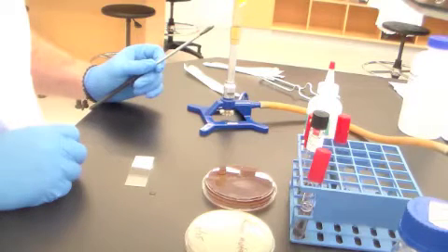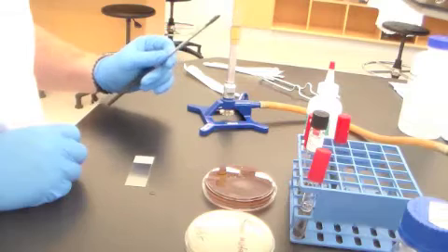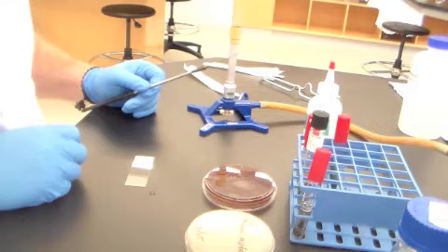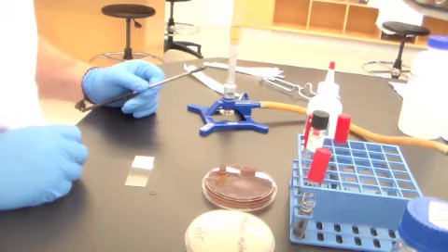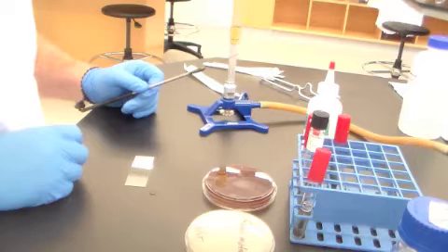So many bacteria that deal with the toxicity of oxygen have also acquired or evolved the ability to break down hydrogen peroxide. That's the enzyme catalase. Catalase breaks down hydrogen peroxide into water and oxygen. So this is a detoxification event.